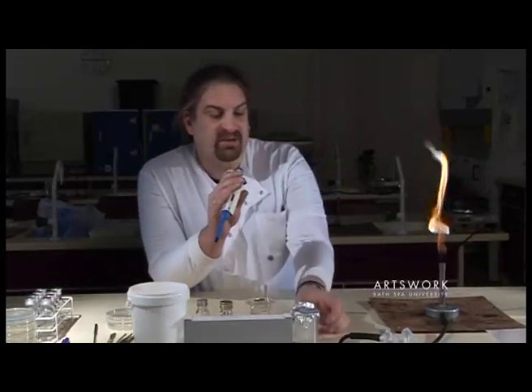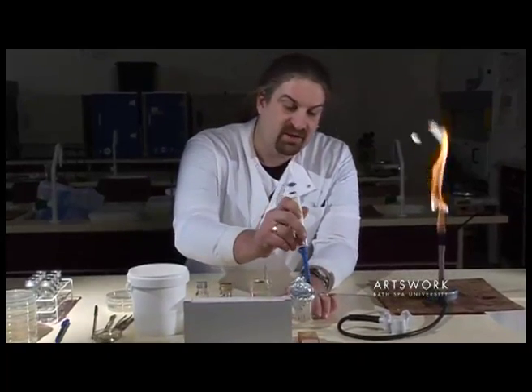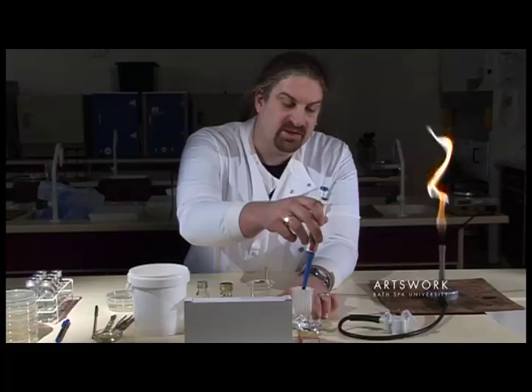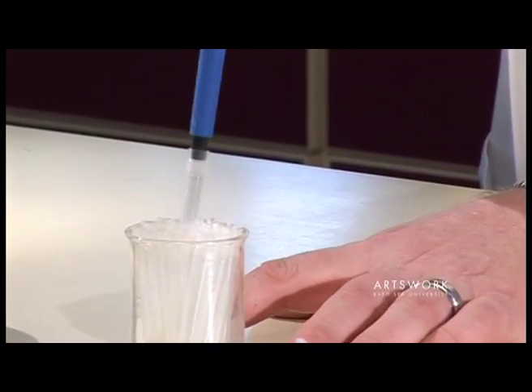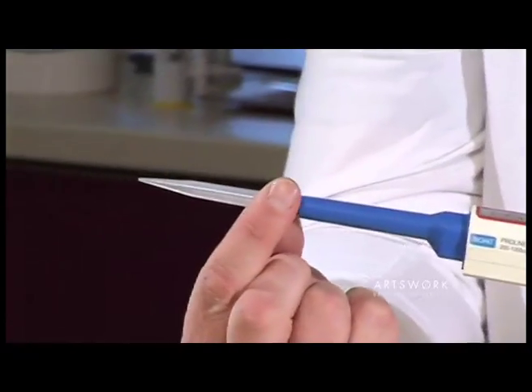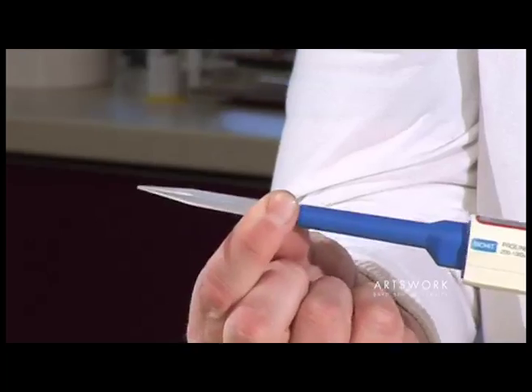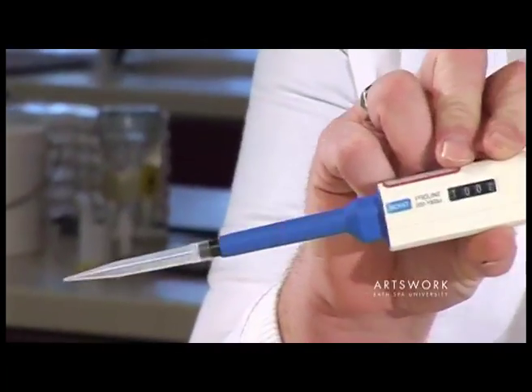This pipette isn't sterile, so in order to transfer samples we need to use a sterile plastic tip. Gently pick up the tip — don't use too much pressure — and then you can use your fingers just on the serrated top to make sure that your tip is firmly attached to the barrel. If it's not firmly attached you won't pick up the correct volume.